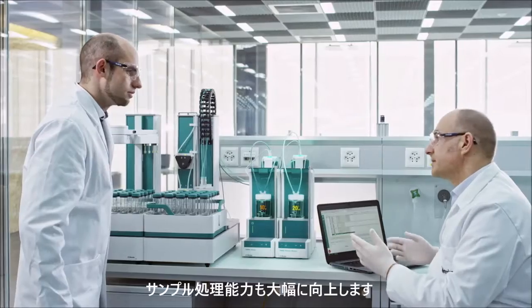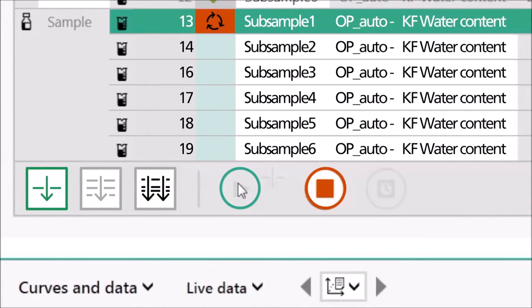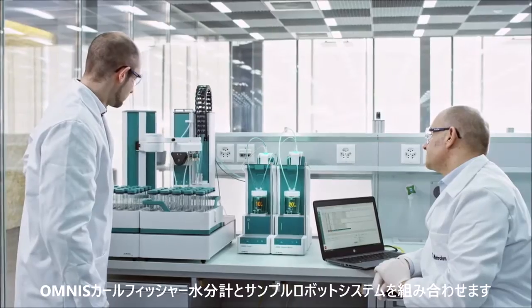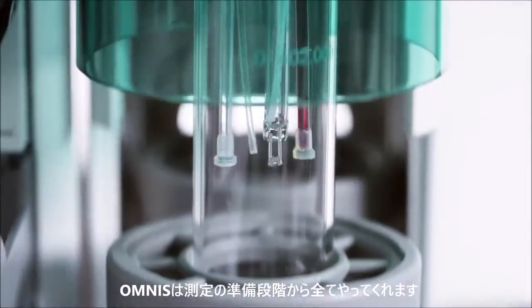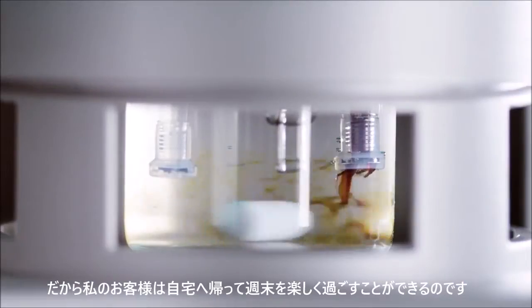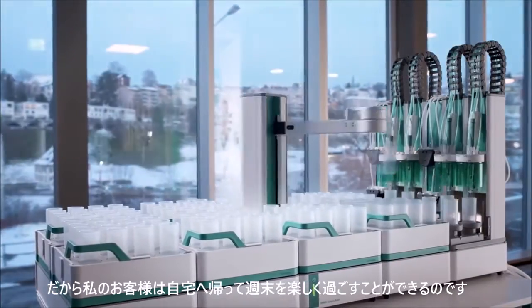Sample throughput can of course also be increased. Automated Karl Fischer titration with the Omnis sample robot. Omnis processes the prepared samples completely unattended, while my customers are already at home or enjoying their weekend.